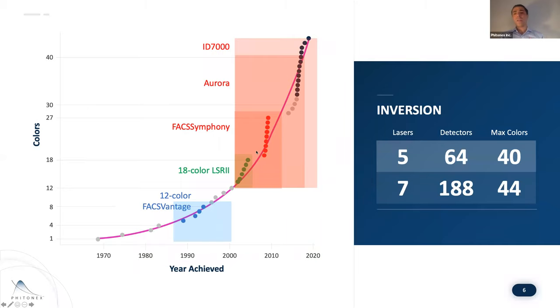And so I'd say that while we've done a lot of work up at this high level, up at the level of the Aurora, et cetera, we've been doing that to inform panel design, inform the way that we create labels, really for everyone and across all of the different components here, and really thinking around maximizing the latent capability of every flow cytometer. So we're gonna talk about that in the context of the current six labels today, and then bring you quite literally right up to date with what we're working on right now, right?